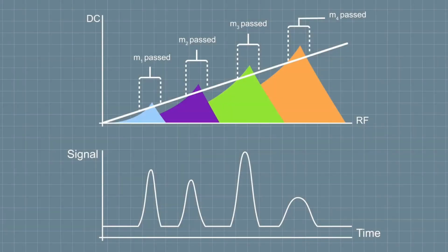But we don't really care with this mass analyzer. We're going to set the slope of the DC RF ramp such that the resolution is set to what's called unit mass, so that means integer mass. We're going to set the ramp such that now mass to charge 20 is coming through, now 21, now 22. We are not going to try and use the quadrupole to discriminate 20.1 from 20.2 from 20.3. We're just going to do unit mass and keep a relatively gentle slope and relatively broad peaks. In GCMS, if it's working right, we don't need resolution.